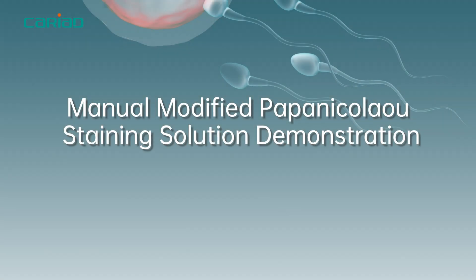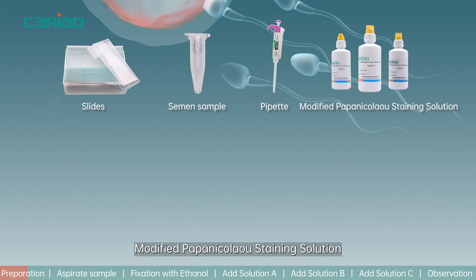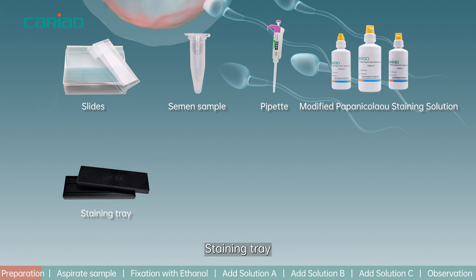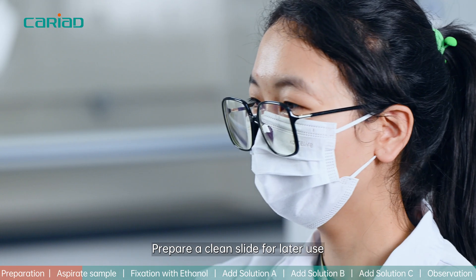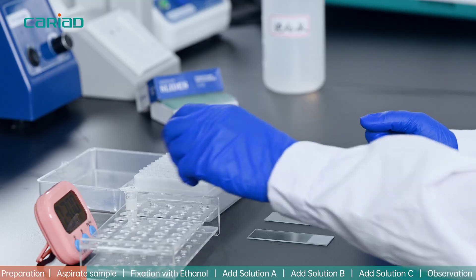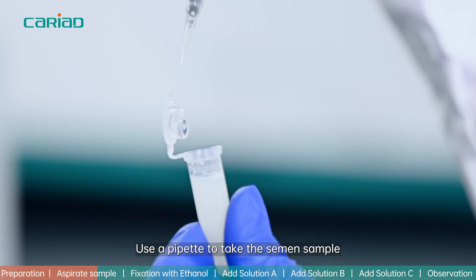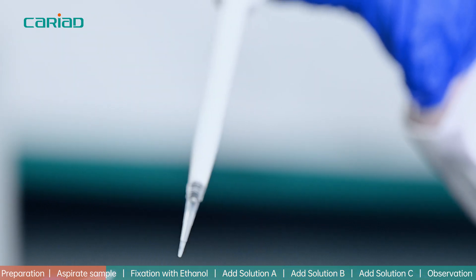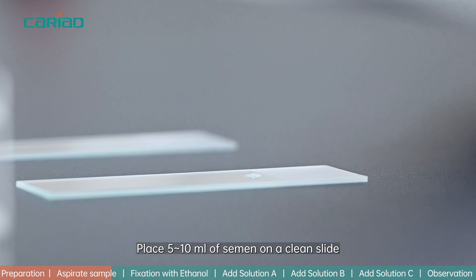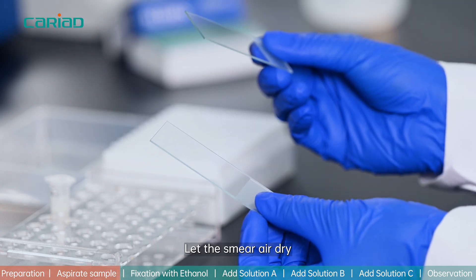Demonstration preparation before operation: slides, semen sample, pipette, modified Papanikolaou staining solution, staining tray, microscope, wash bottle, timer, and 95% ethanol. Step 1: Prepare a clean slide for later use. Mix the semen sample well, use a pipette to take the semen sample, and place 5 to 10 microliters of semen on a clean slide. Evenly spread the semen by crawling with another clean slide, then let the smear air dry.